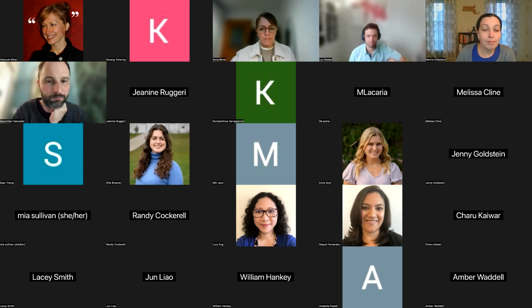I think it'd be great, since we have a little bit of time and I'm a bit of an opportunist here, if we could go through and show some of the tools that are available on the UCSC Genome Browser, highlighting some of the tools that could be used for some of the work that our ClinGen curators do. And maybe even some of the tracks that are the most important for variant curation.